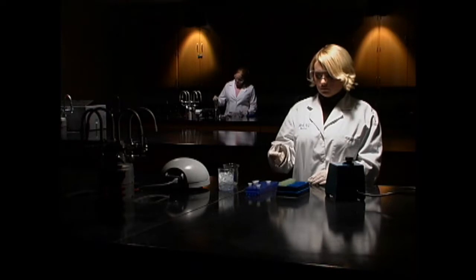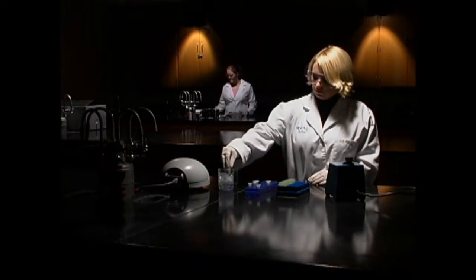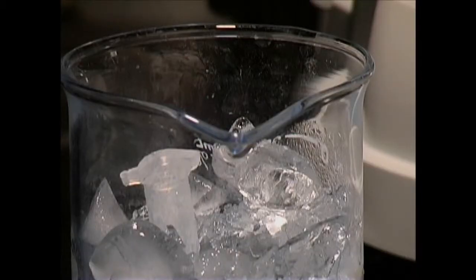The cell lysis solution contains sodium hydroxide, which will break down the proteins, RNA, and some DNA. The solution also contains a detergent called sodium dodecyl sulfate, or SDS. SDS dissolves the cell membrane and denatures proteins.